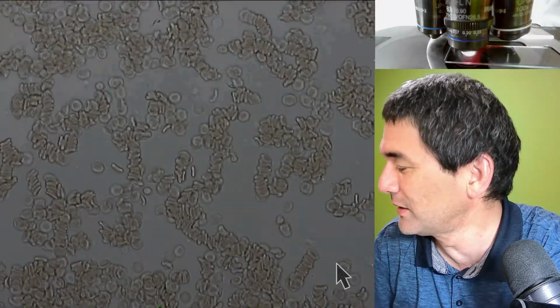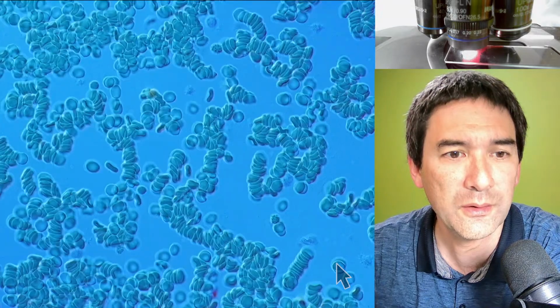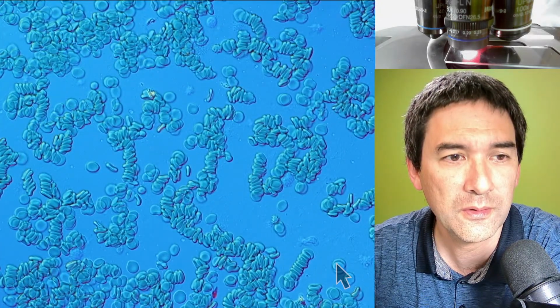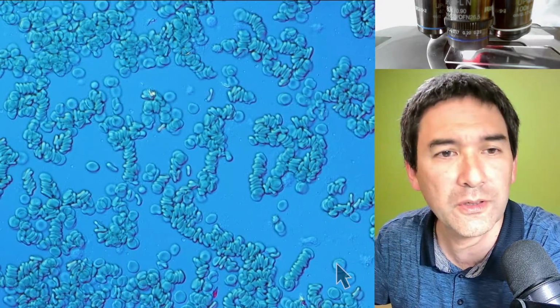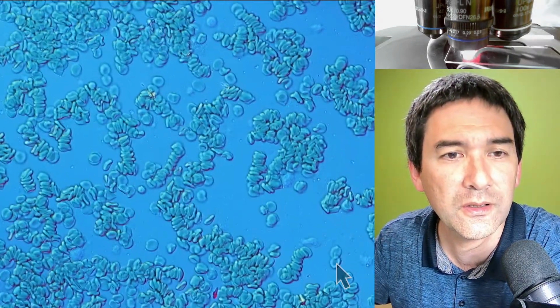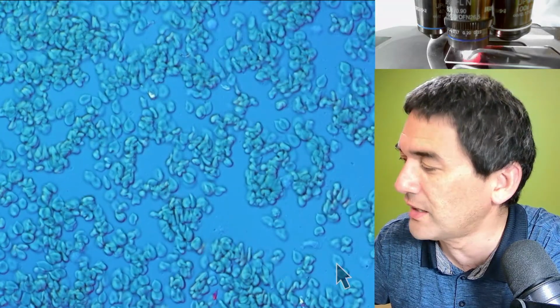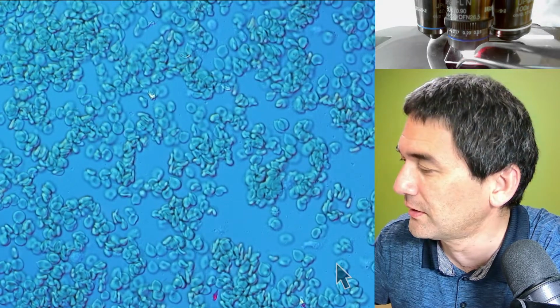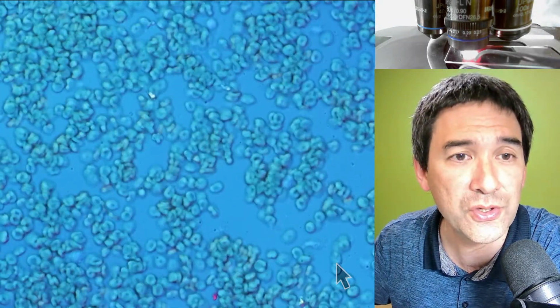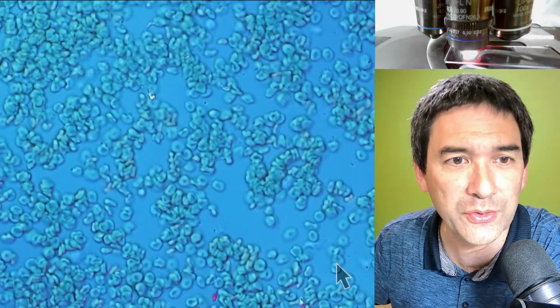So let's go back here again. Yep, here we go again. Let's press against it a little bit and do some other stuff. See? And when you do that, you actually see how the red blood cells start to deform. And then those stacks also start to break up, of course. It goes a little bit out of focus, of course, because I'm pressing down on the slide.